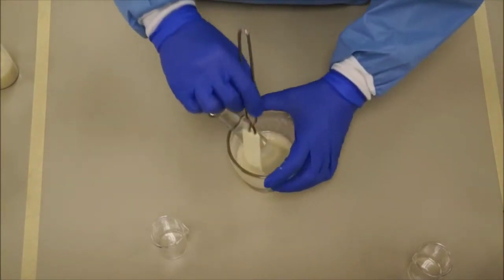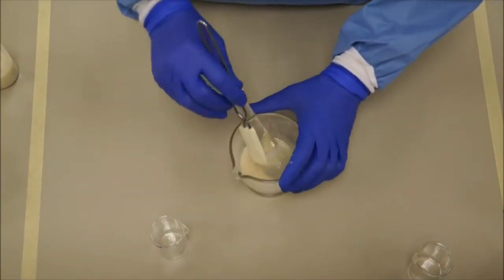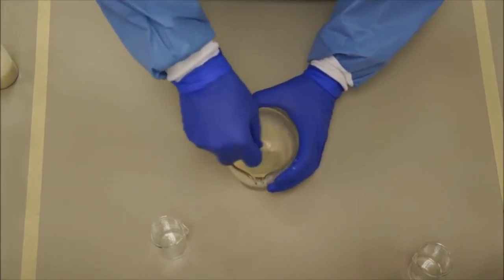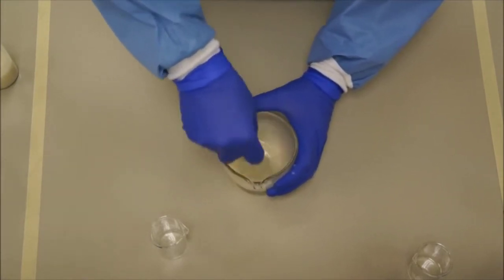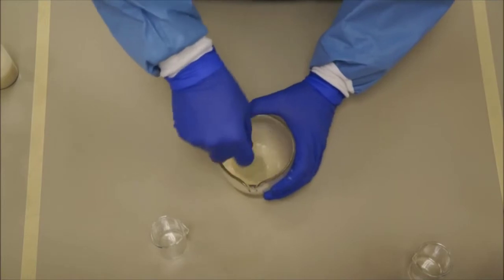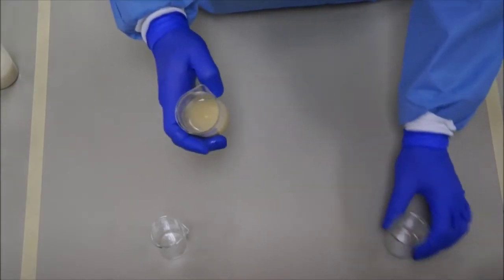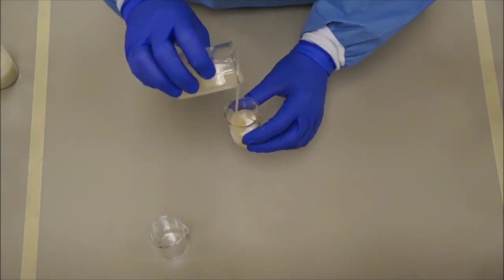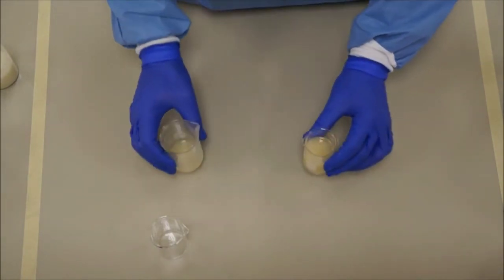If you have any excess on the walls, you can scrape it out with the spatula. Keep the process going for about five more minutes, and after that you will have a very nice smooth emulsion. You can then transfer it to another beaker.